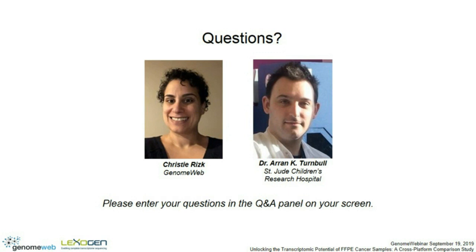So you mentioned several correction methods in your presentation. Do you have a specific one that you prefer in order to reduce systemic bias in FFPE samples? So I personally, I've used a lot of these for a long time now. My two preferences would be XPN, or cross-platform normalization, and ComBat, both excellent approaches. One of the advantages of ComBat is that, as I said before, you can have unbalanced data sets. For example, you can have a data set with a smaller sample size and a larger sample size and still effectively reduce the bias.